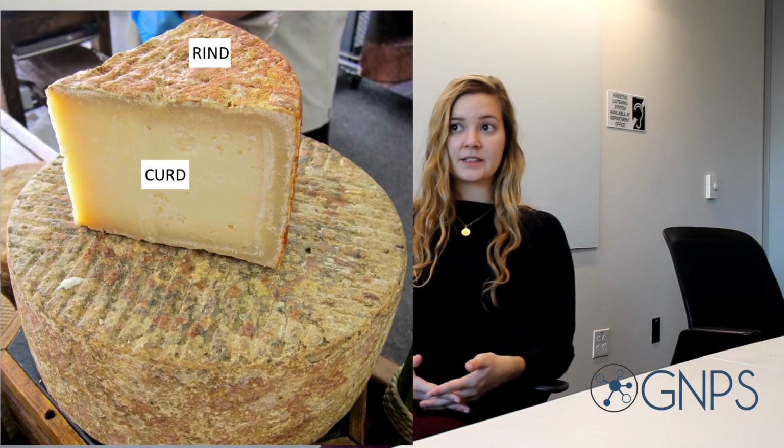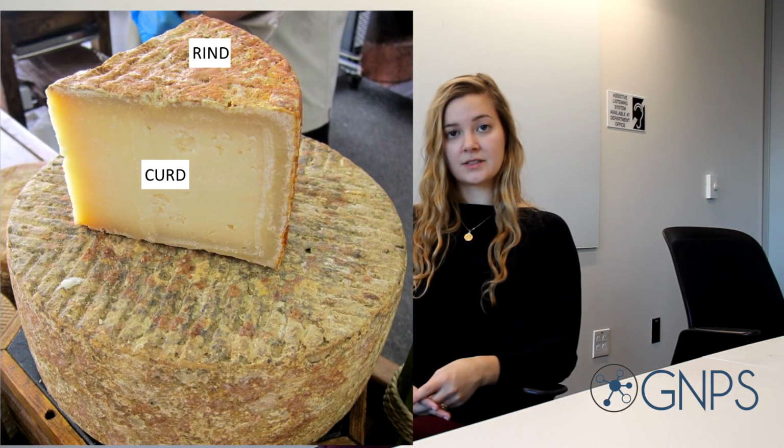So the cheese that we were looking at in this study is a Stilton, which is a blue cheese. And we were interested in differentiating the molecules in the curd of the cheese from those at the rind. And this was supposed to enable us to look at how rind-associated microbes contribute to the smell and taste of a cheese differently, maybe, from those microbes that are in the curd. And so to do this, we collected data for volatile compounds in chunks of the Stilton using GCMS. And we also collected sequencing data from both the rind and the curd.